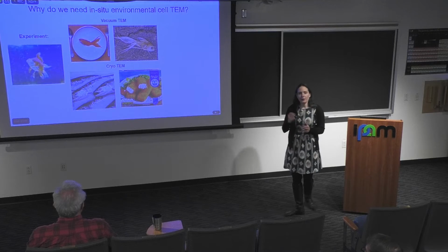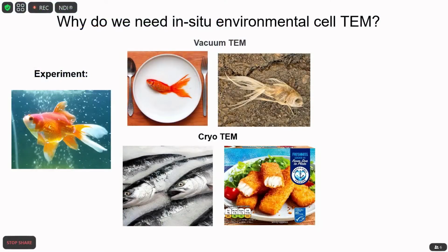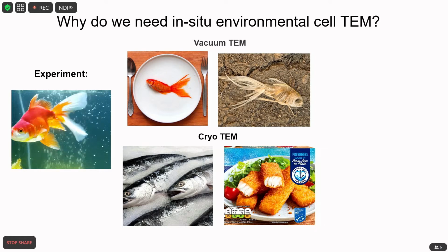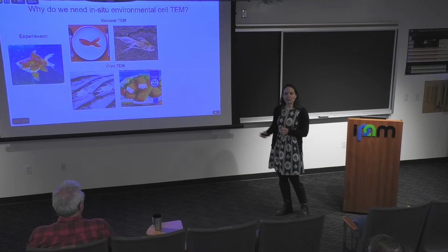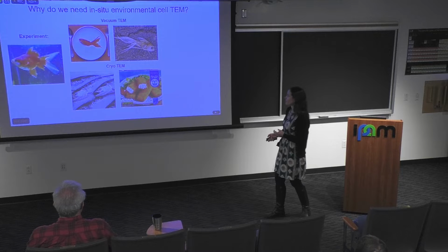We can also use cryoelectron microscopy, and sorry, cryoelectron microscopy is a fantastic technique. Nobel Prizes, Science and Nature papers coming out all the time. It's incredibly powerful. But hopefully cryoelectron microscopists would agree that it is not the same as looking at your liquid phase process happening in real time.